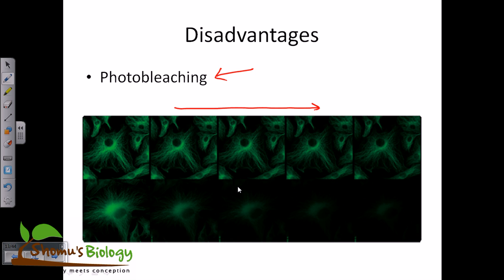So for solving this problem, we now use chemicals which have higher resistance against photo bleaching, which can work more cycles than any other general compounds. Or we can put a high amount of fluorescent tag or fluorescent proteins in different regions inside the cell, so that they continue this process through a long time, right? So these are the troubleshooting steps for this particular photo bleaching problem.